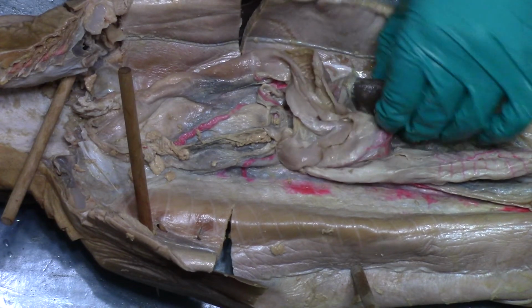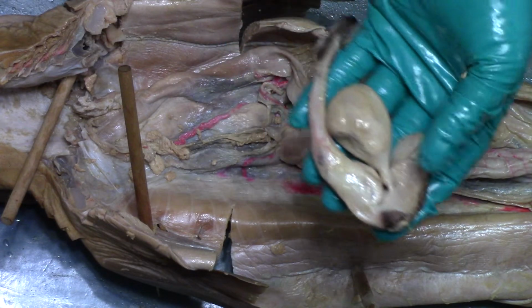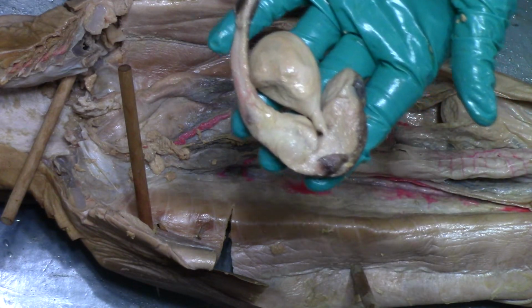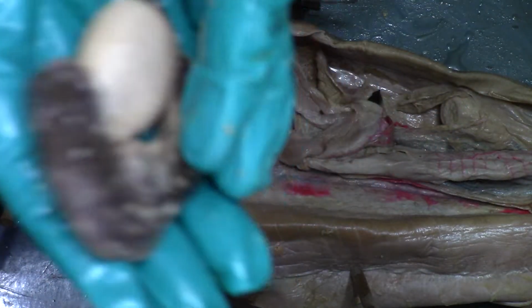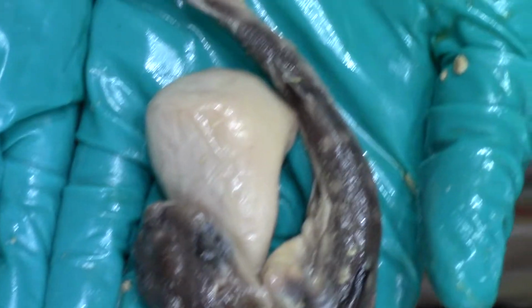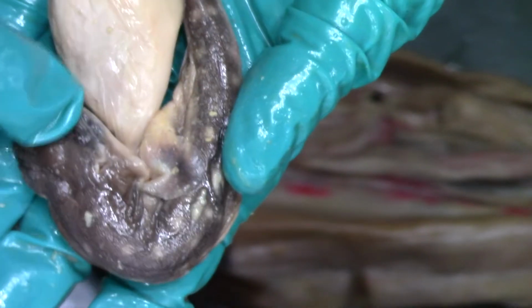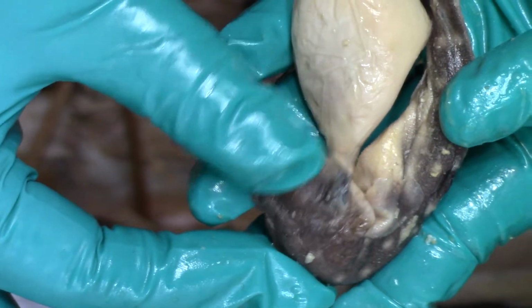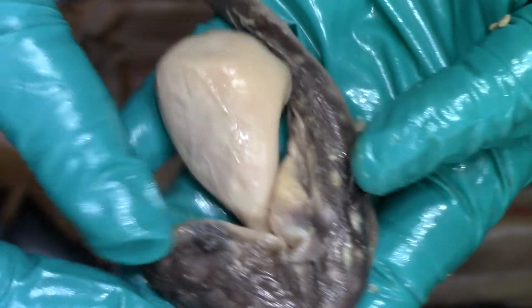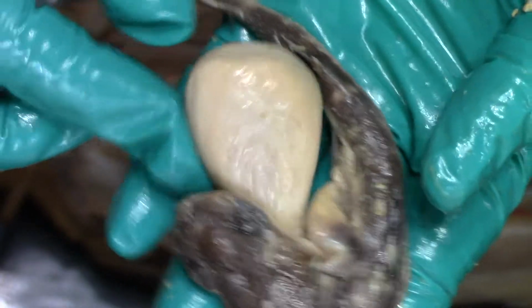Oh my god. Is that a baby shark? Oh my god! Hey! Here is a baby shark with a yolk sac. One second. So here's the head, and you can see the little eye. And there's his little mouth. See his little mouth? His little eye. And he's curled around. There's his little tail. And he's still attached to his yolk sac.